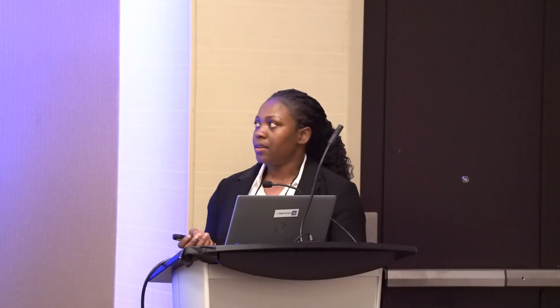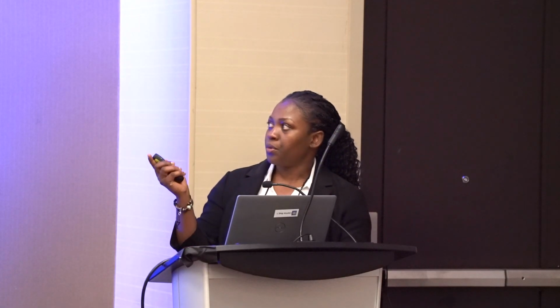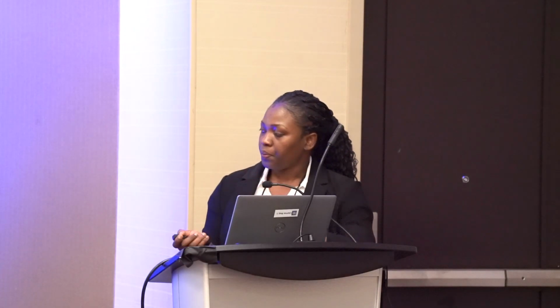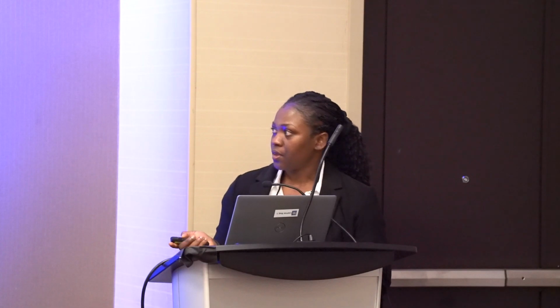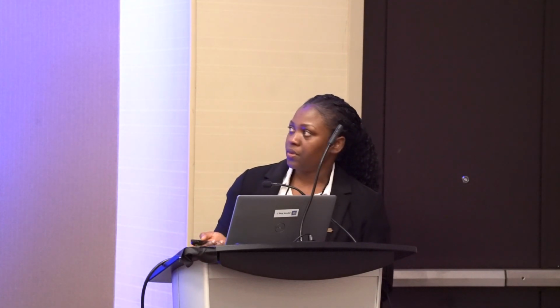Another key index that we looked at was the translucency score, which gives us an idea into the eggshell defect. And this is basically passing the egg through a candler. What we had was a 3-point scoring system, with 1 giving us few to no defects, 2 having small translucent spots, and then 3 giving us larger as well as several spots. And this was quite interesting to observe.